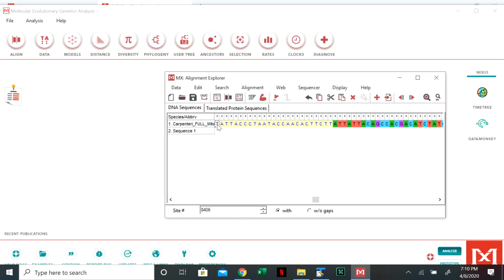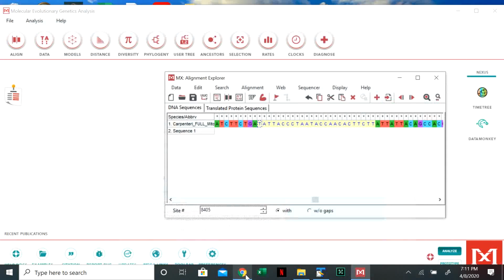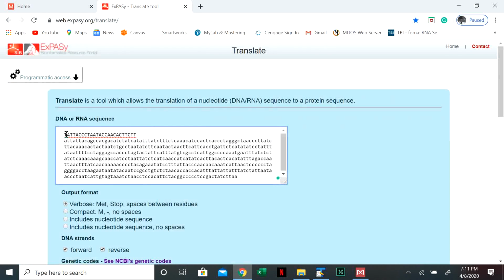There are two ways to look for the methionines. When you are looking for where the start of a gene is, you want to first minimize the amount of space between each of the genes, because mitochondrial DNA is super compact.